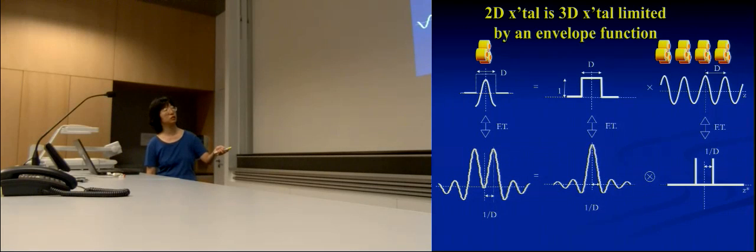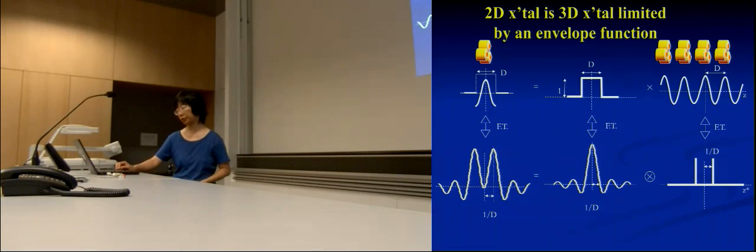I'm plotting this here, it's the 0, so I'm plotting both in the positive and negative direction. This is just the amplitude. And this transform turns out to be a sinc function, centered at 0. You will always see a node at the distance of 1 over d, which is the size of that envelope.